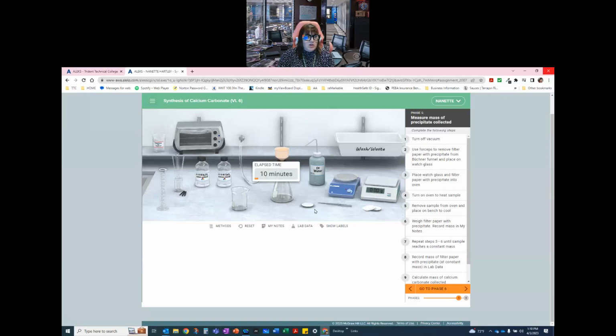Now I get questions, why do I have to do this? Well, let's see what happens if I do this. Pick this back up and I put it back on there. 1.72 grams. Oh dear Lord, that's a pretty big difference.